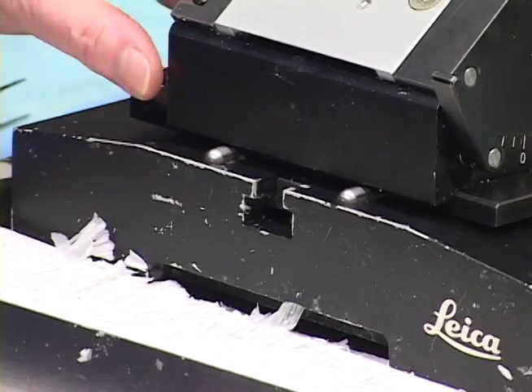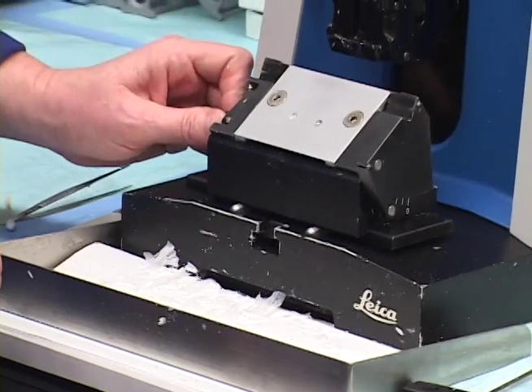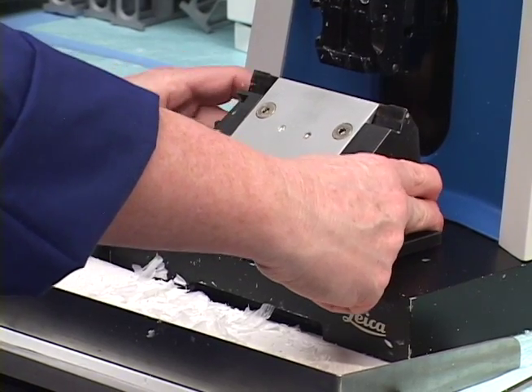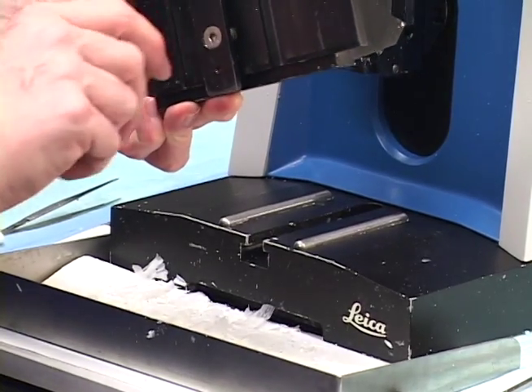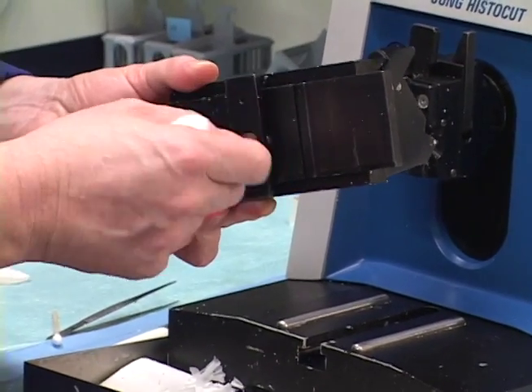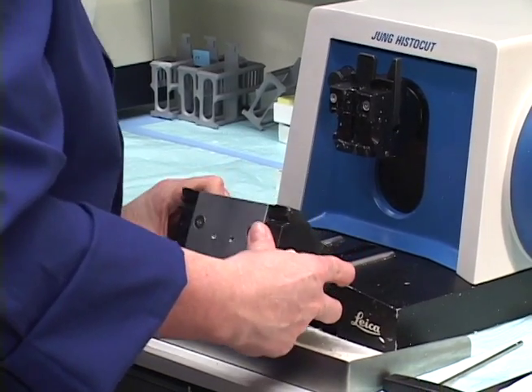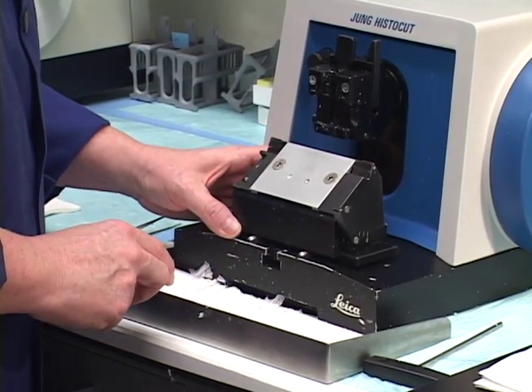If it's loose, you'll kind of feel like it wants to give. Even if I fully clamp it, it would still want to give. If you ever have that happen, then it's more than likely this little bottom screw just needs a very slight turn — like maybe an eighth to a quarter turn. So again, leave about a quarter of an inch or so.